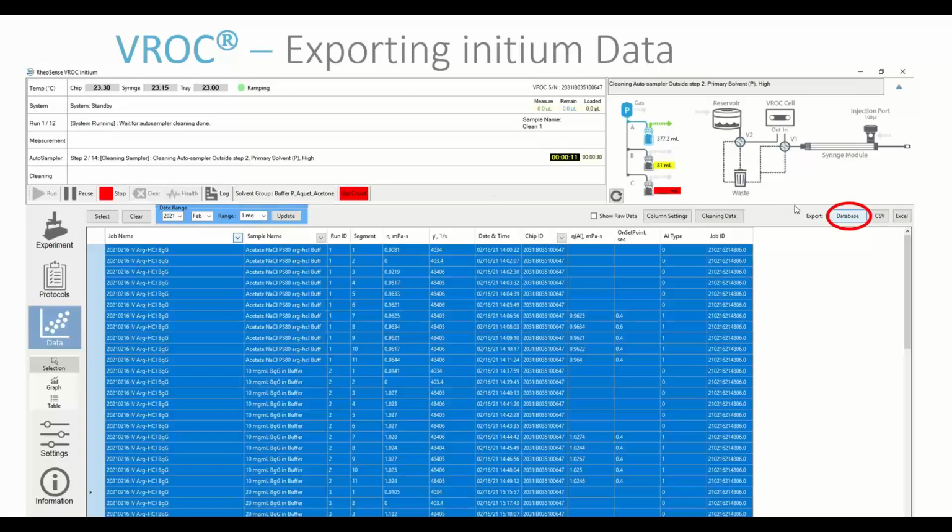And then you want to export to a database file. Clariti reads everything in a SQL database format, and that's what this export will do. However, if you don't have Clariti and you have an Initium, that's okay. You can export the Initium data as a CSV file or even an Excel spreadsheet. So we make it easy for you. You can choose whatever you would like.